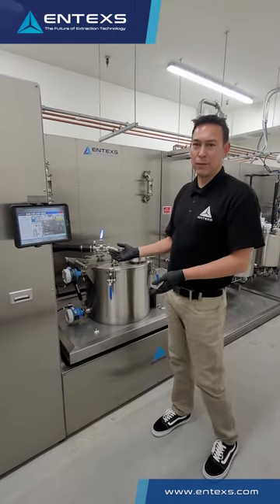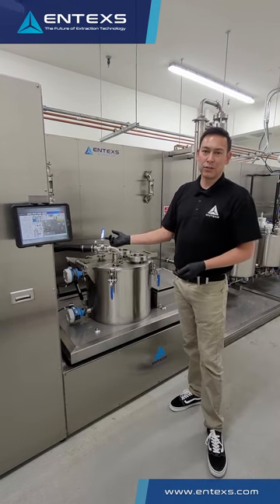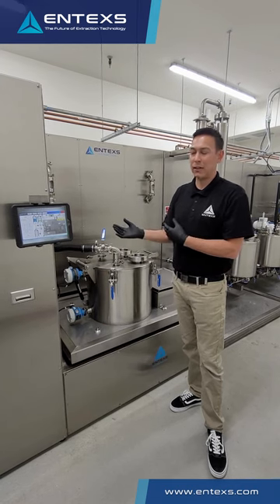This is designed to hold up to 15 pounds of biomass input using cold ethanol extraction. This removes the oil in a very clean way so you don't get the fats and chlorophyll lifted out of the process.